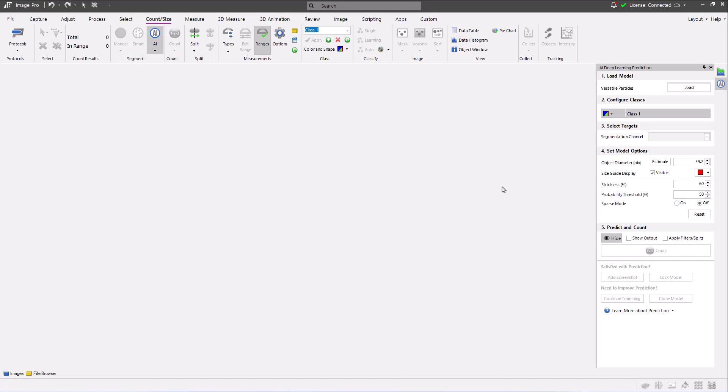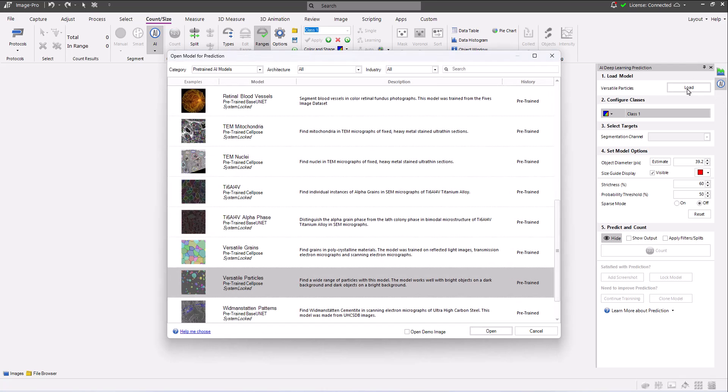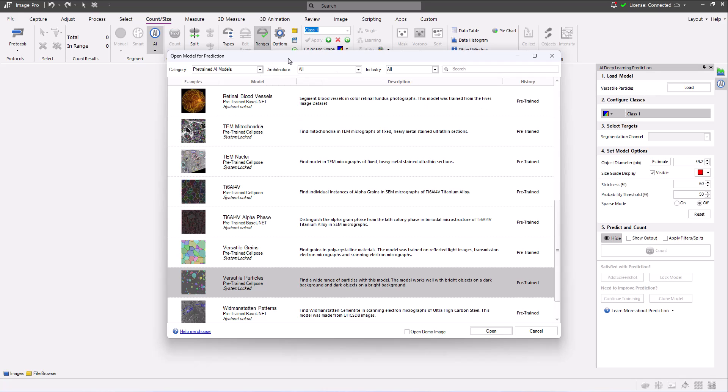Click the load button to display the open model for prediction dialog. Here I'm filtering on pre-trained AI models to show you the full library of pre-trained models available with ImagePro.